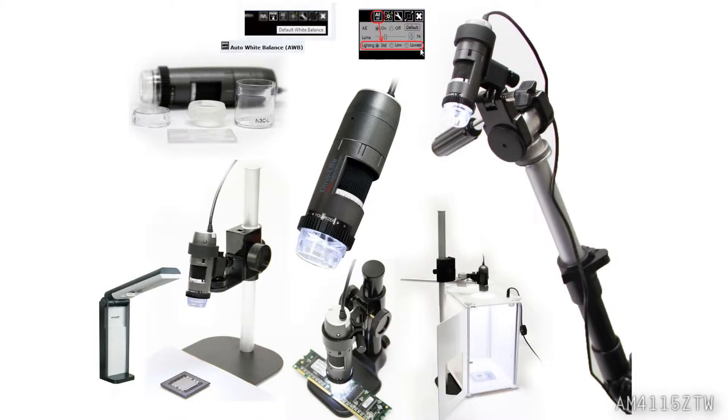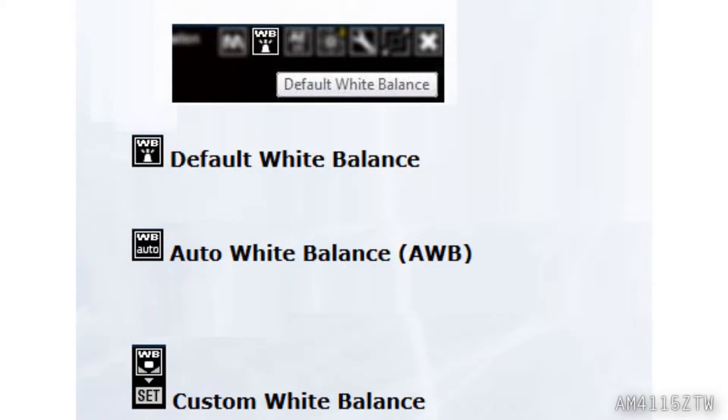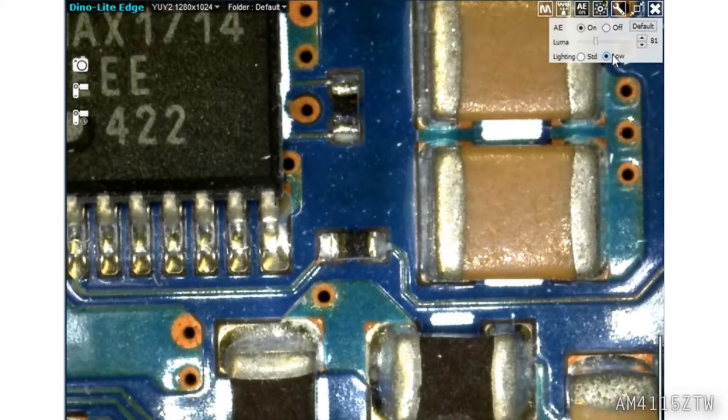For the highest quality results, make sure there is ample lighting and a Dynolite stand. Features such as white balance, auto exposure, luma, and low lighting enhancements in DynoCapture 2.0 will go a long way in creating high quality results.